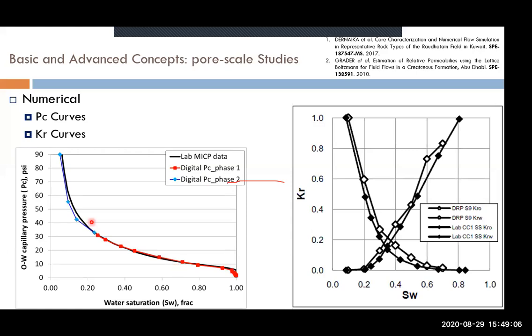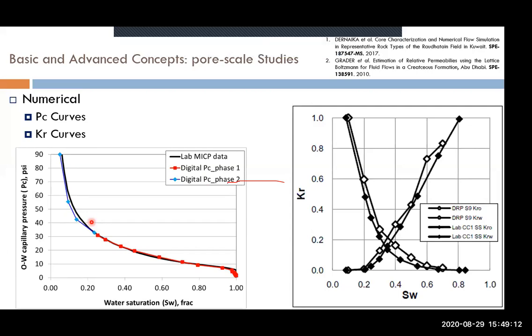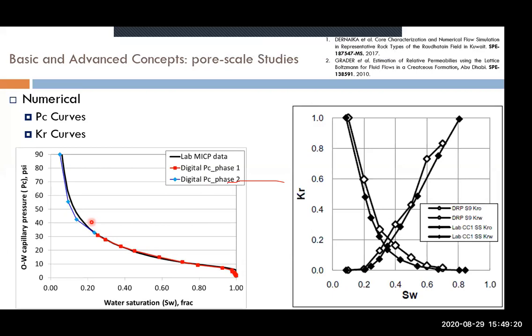That's one of the things that you can use to do quality control steps during your workflow, in the digital rock workflow. Yesterday we saw this. Some steps we have to stop there. We have to take a look and analyze to see if the results are okay or not. You have to perform this quality control using, for example, MICP, pore information, and then you can go to the other step. But even though you can define a workflow, you have to be careful about the limitations of each step. We just discussed about it, but it's really positive.